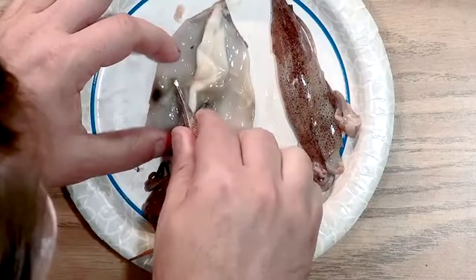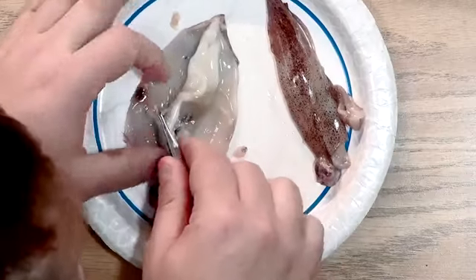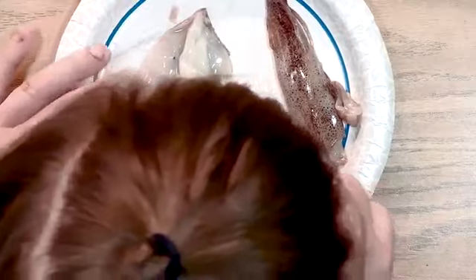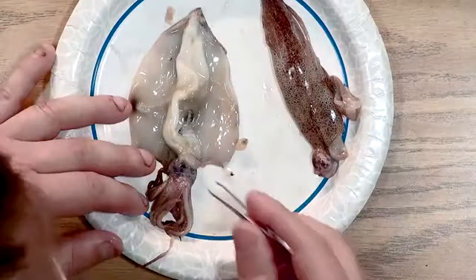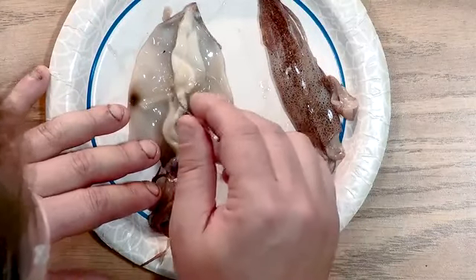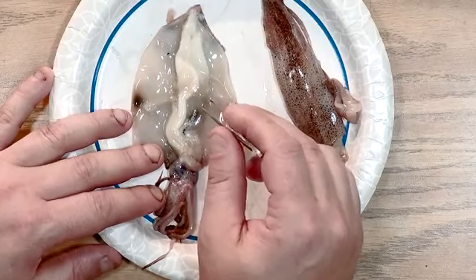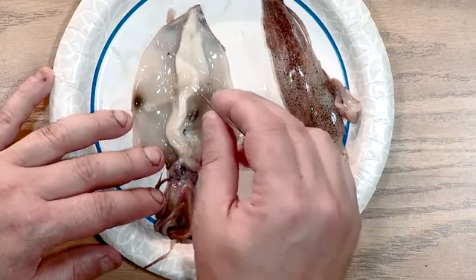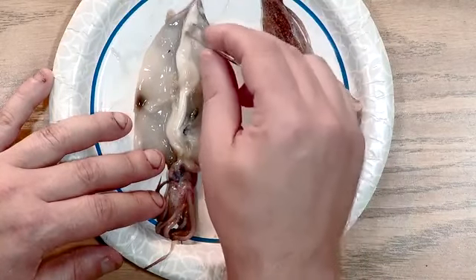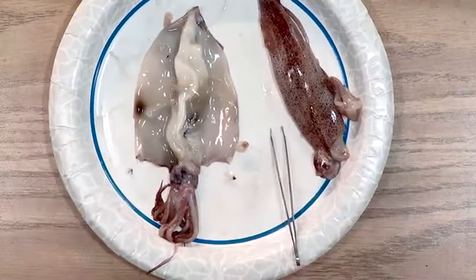Now, this guy, honestly, doesn't have very good looking gills or lungs. They're usually feathery and attached to that side. Maybe when we look at the other guy, we'll see a better image of it. Now you can see a little discoloration down here in the middle area. And this discoloration is the liver. It is right about here. And as I come further down the end, most of this white area is the reproductive organs of the squid.